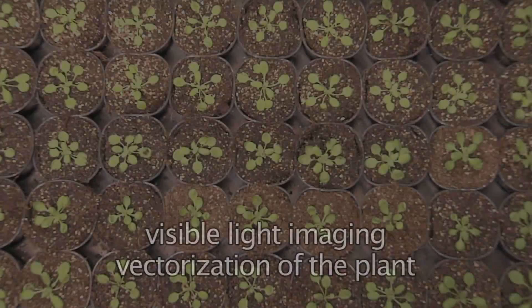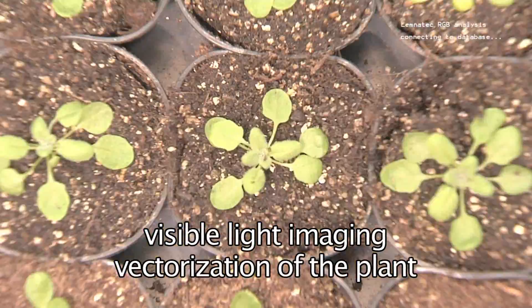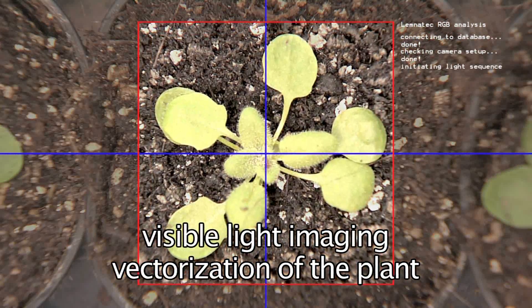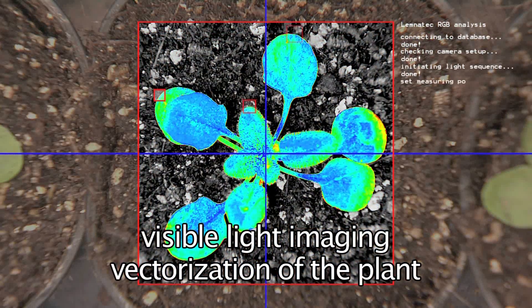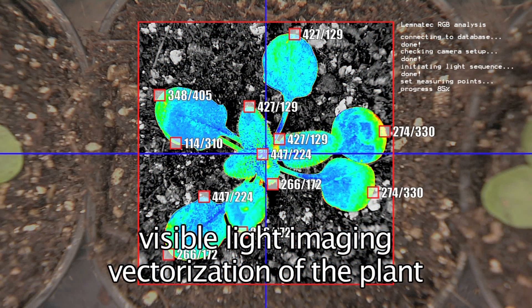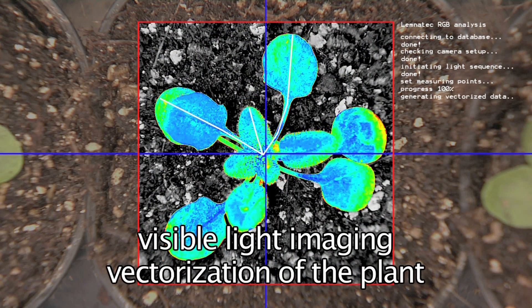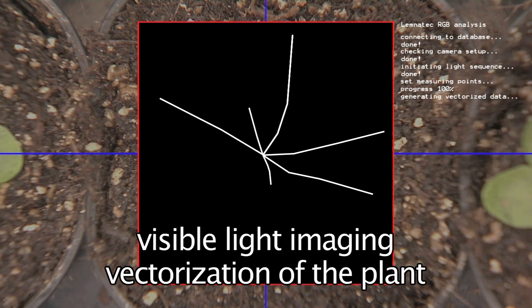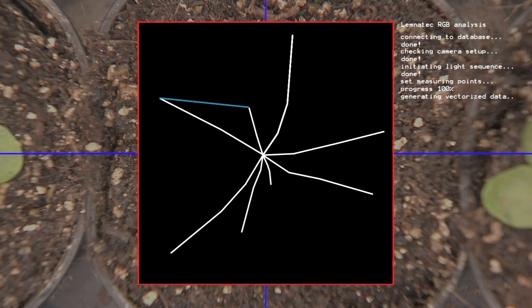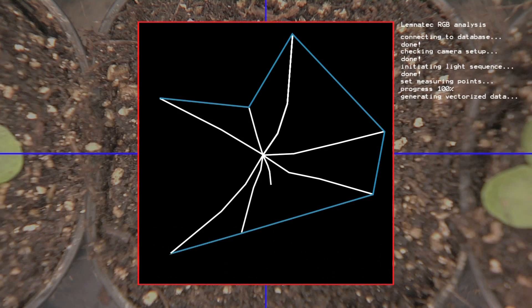Visible light images are analyzed by the Lemnatec image processing software to vectorize the test organisms and provide all visible parameters, such as size, shape, color, area, mobility, or number of detected objects.